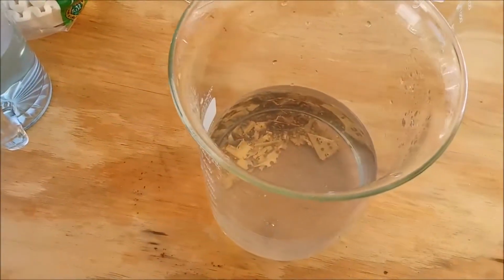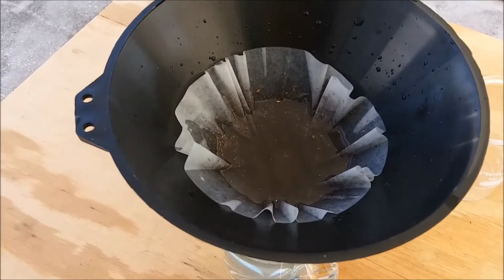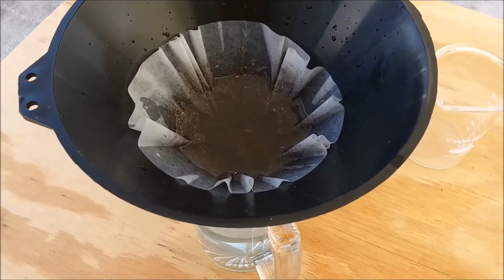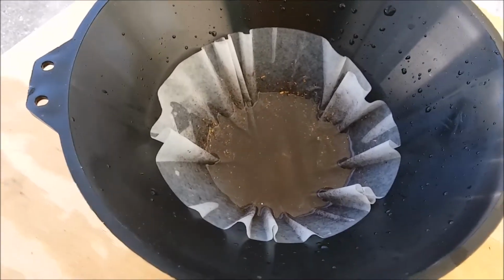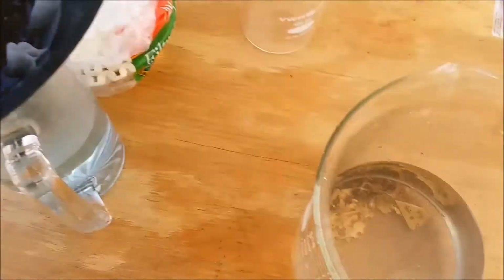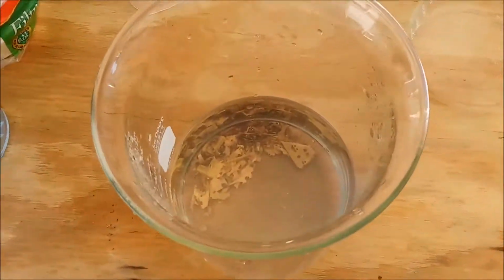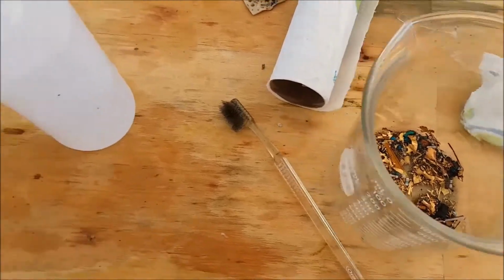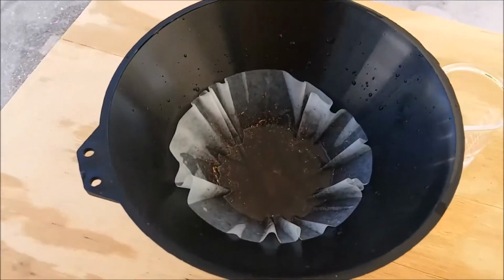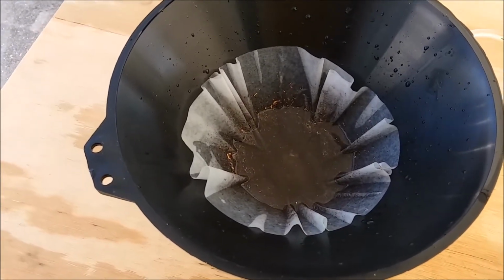I am decanting off this rinse water through the filter I used earlier to decant off the processed liquor. So I'm catching any gold that comes out of here, getting it on the same filter I used before, plus I'm washing all of the base metal residue out of this filter. So once I have all this rinse water decanted off through here, I will combine the gold foils in here and just put them in this beaker with the other gold residue. And once the water finishes draining through this filter, I'll put the filter in there too. Then all the gold will be in one beaker all together.